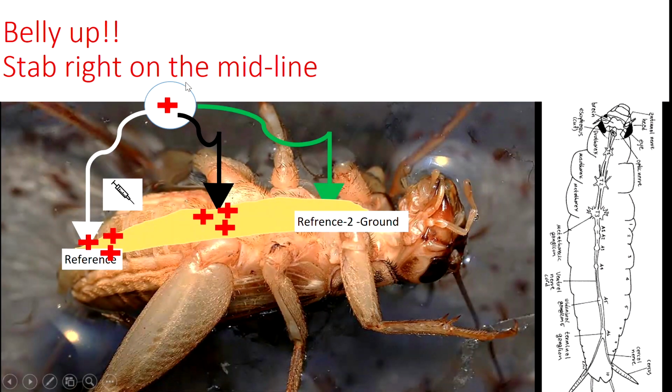The way we set up our PowerLab to read voltage is a little bit complicated. You can program that to read differently. However, this way we're more error-proofing. If one of the electrodes didn't get pinned right into the center of the nerve, and they're a little bit off, we can still have readings. About how to set up the PowerLab readings, that can be another whole semester's lab, and we don't have to dive that deep for this course.